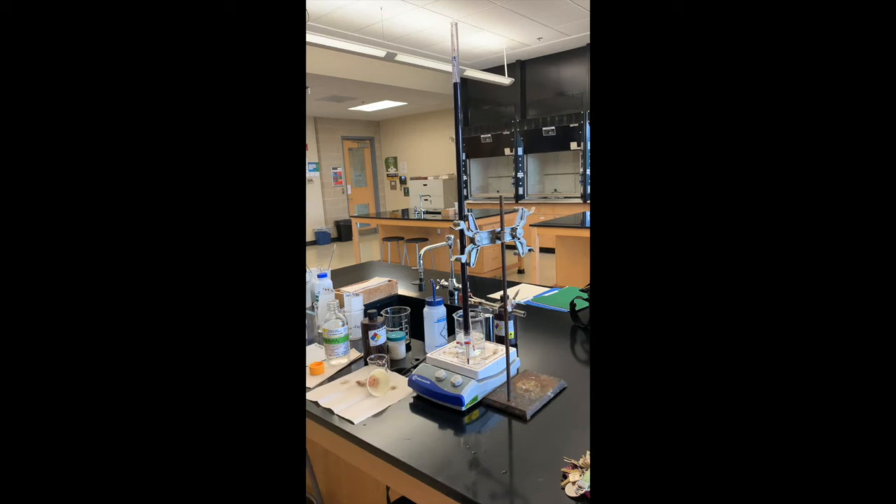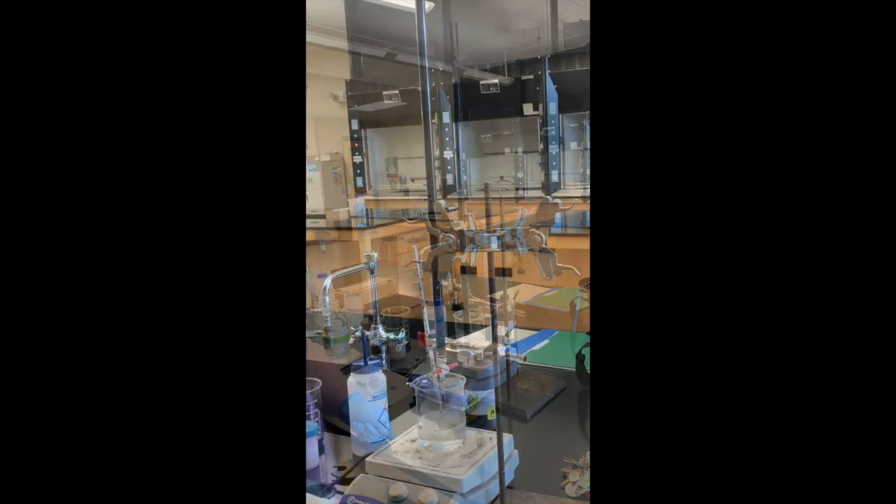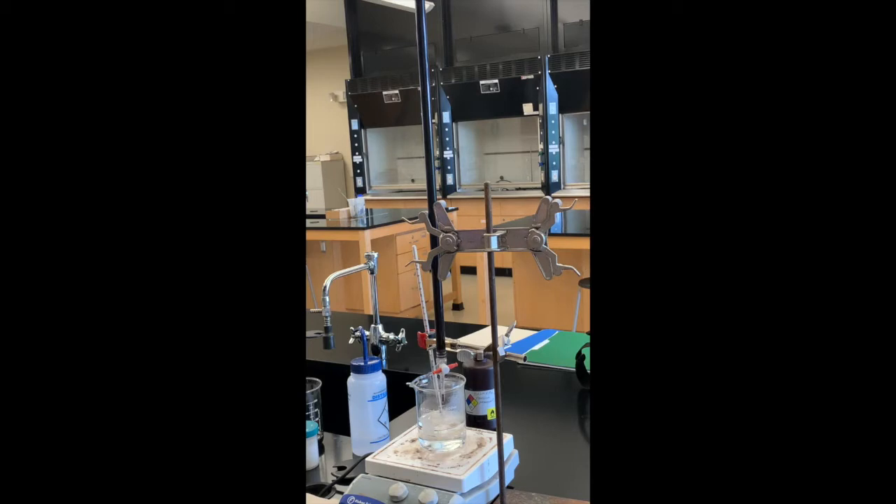I just put my thermometer in so I can monitor the temperature. Once that solution gets to about 60 degrees I'm going to take the thermometer out or rearrange things so that I can titrate. We still want to heat while we're titrating so I'm not going to take it off of the heat. This is our setup — we're just waiting for it to heat up and take the initial volume.